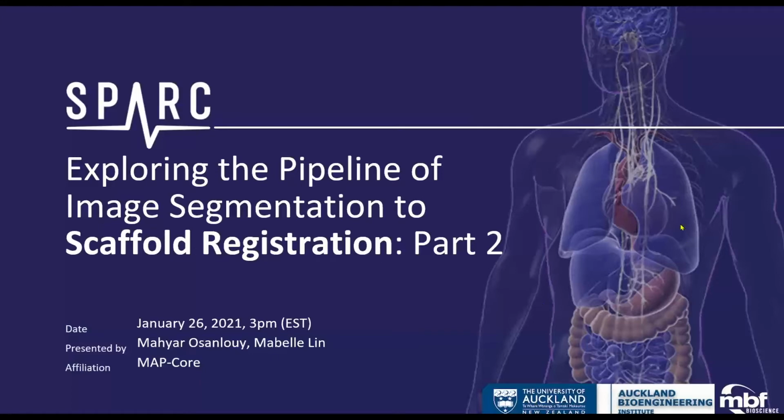Today we will take off from where MBF left at part 1 of the webinar series and continue to explore the pipeline of scaffold registration using segmentation data. For any of you who missed part 1 of this webinar, or wishes to revisit it, you can find the YouTube link at the end of this presentation.